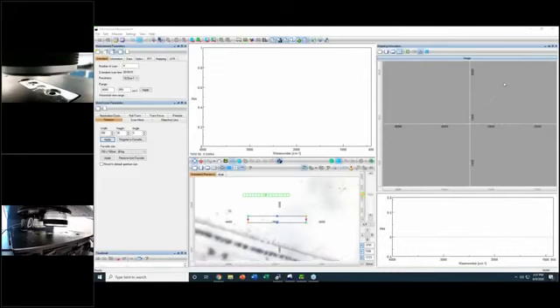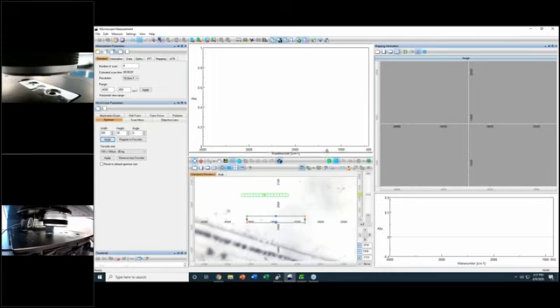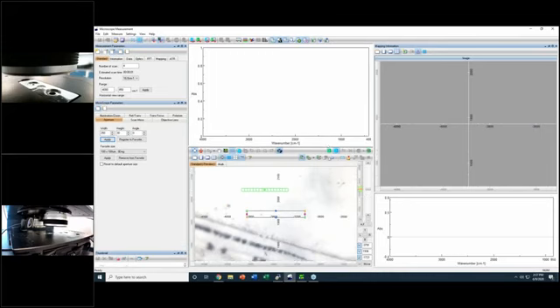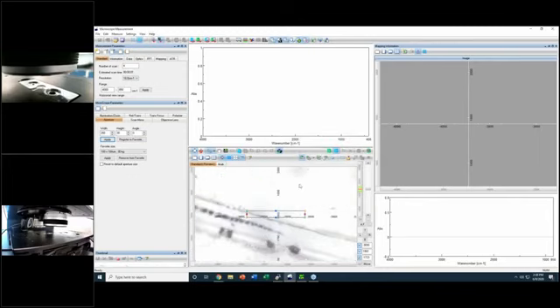So now we are in the IRT 7200, and this instrument, as I mentioned before, is designed for fast imaging, and it has a 16 linear array MCT detector.